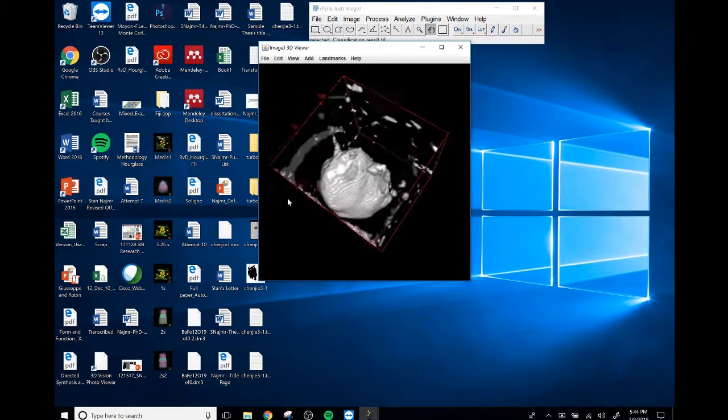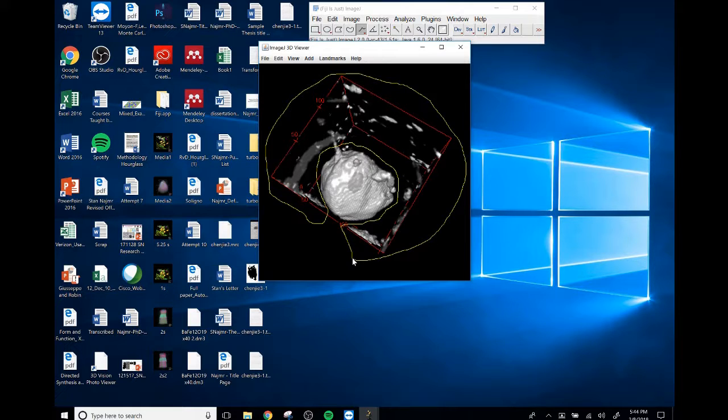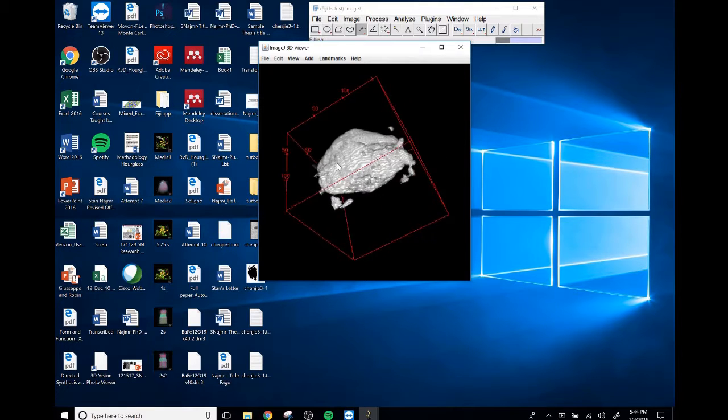The way that you remove these is you do a little cleanup. So you take this drawing tool here, this loose drawing tool, and you can kind of go around like that, and then probably do another big circle around like this. Close it off, and then say fill selection. And the fill selection will delete all of those things.